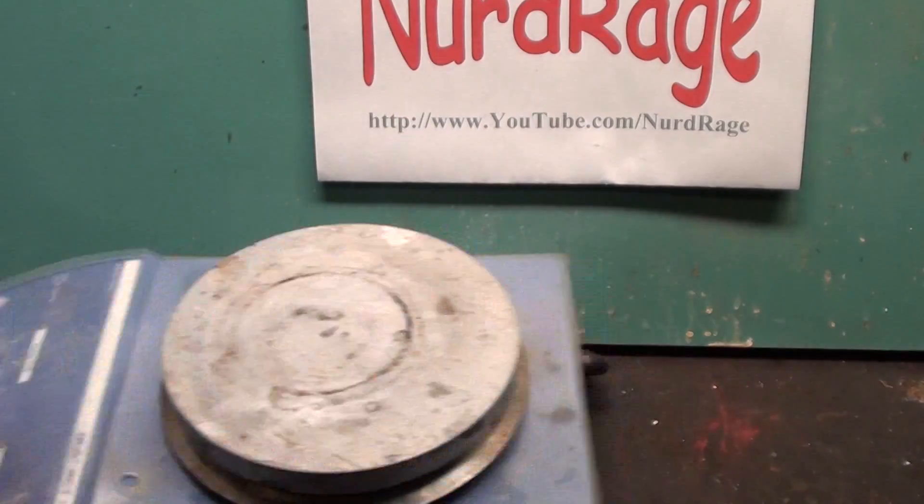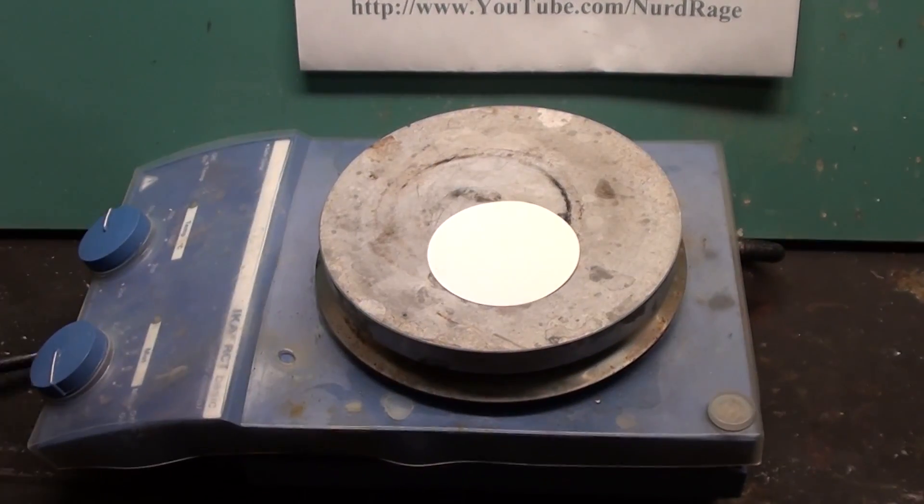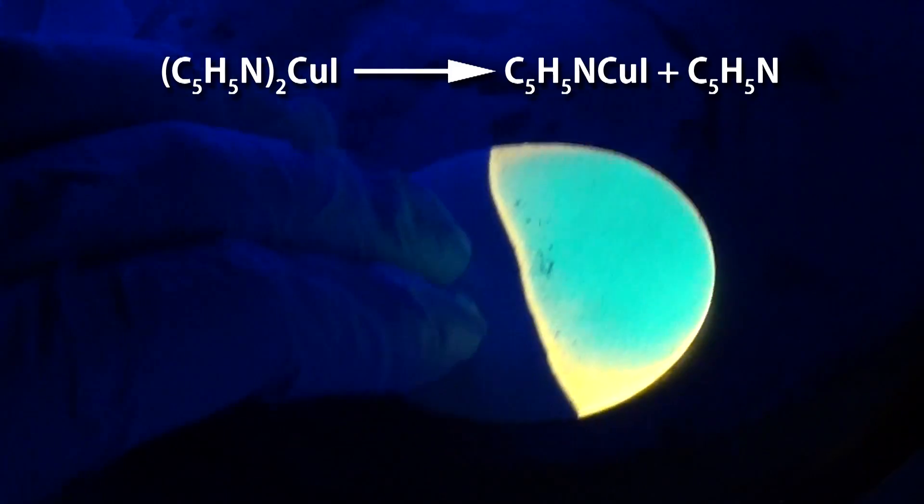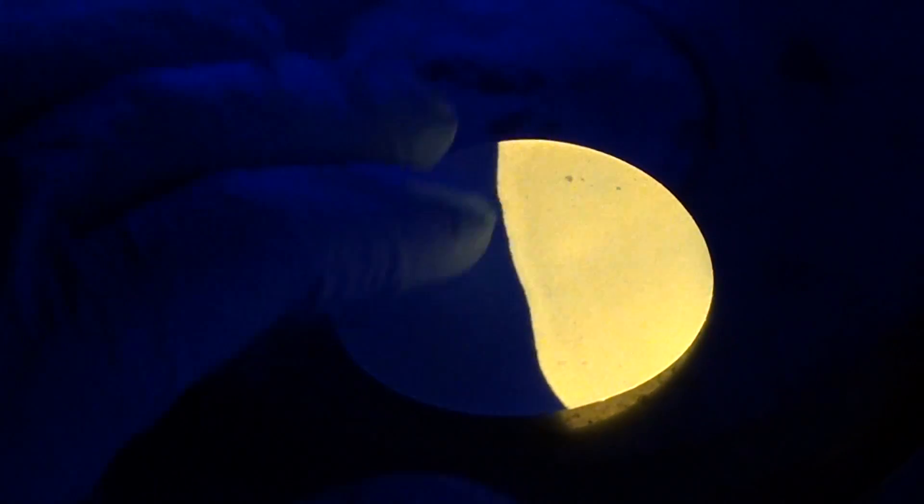Let me get my hot plate. Heat it while the ultraviolet light is on it and it will quickly convert to mono-pyridine copper iodide as it liberates another pyridine molecule. As soon as it turns yellow, remove it from the heating or it'll decompose into copper iodide and pyridine.